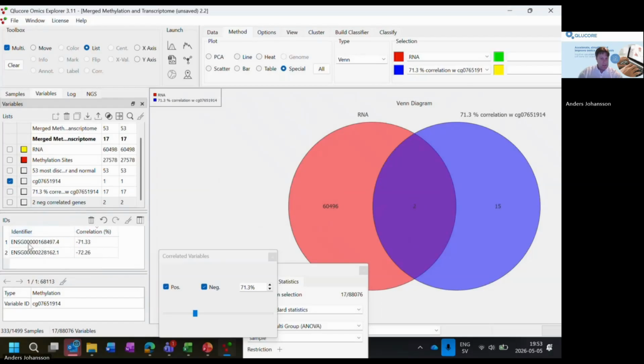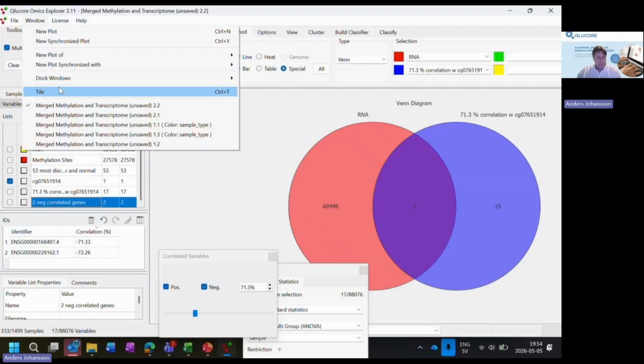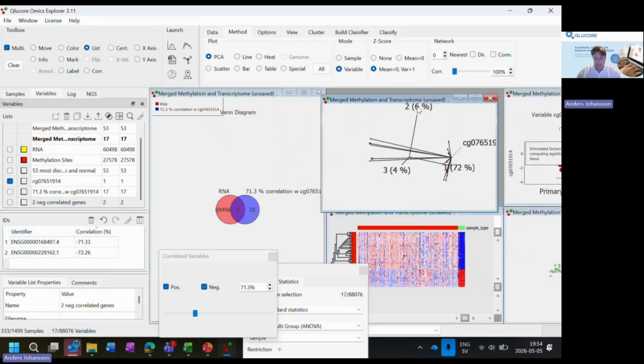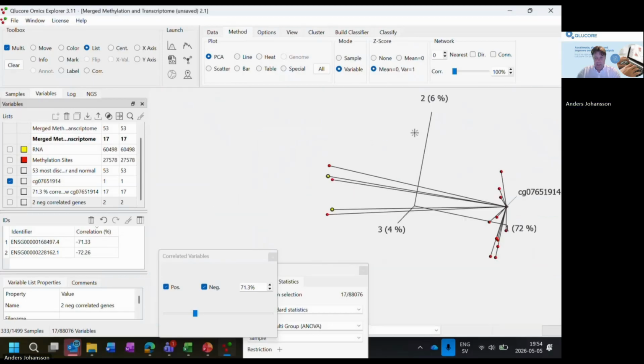the Ensembl IDs. So here I wanted to finish and then return back to the pile of plots that we have worked with so far, and bring this one to the front. And again, repeat why I said these ones were negatively correlated.